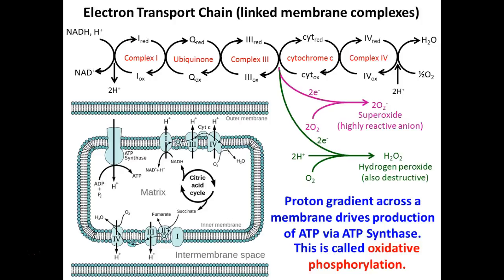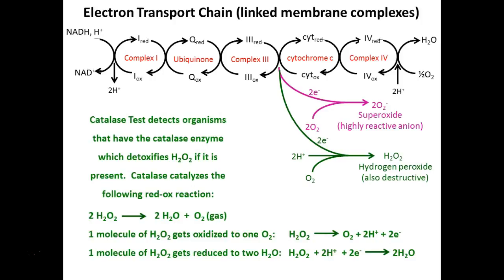So on the bonus, someone put us with the peroxide first? Yeah. So when we do this test, we're actually adding hydrogen peroxide, and if the organism has catalase, it will break it down into water and gaseous oxygen. So we'll actually see bubbles.